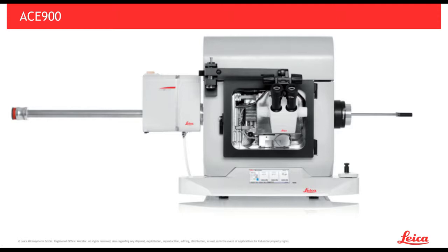So let's get started. Our first question is, are there ways to mark proteins or complexes of interest in preparation for freeze fracture?